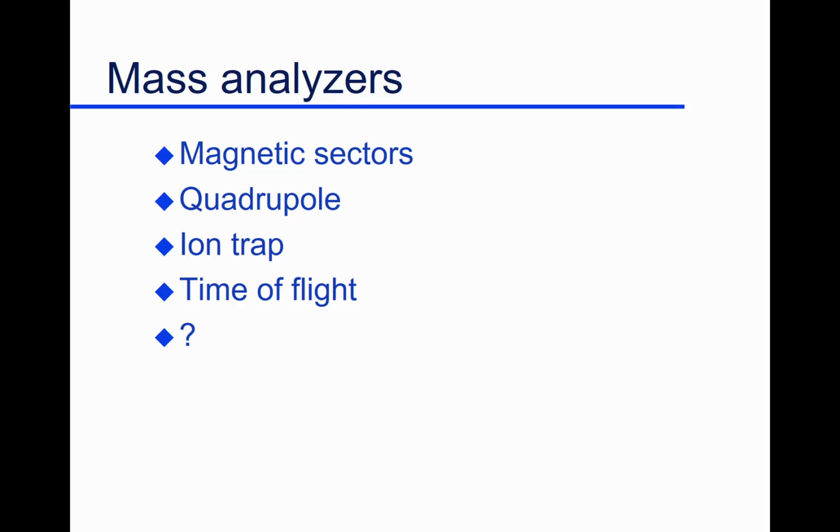But now we've formed a bunch of ions probably. There's seldom one thing there. There's perhaps many things in your sample. So you're going to have many ions. Now we need to start separating those ions. So we get an ion profile. What is the mass of that ion? Well, was it 2,400 and something in the last one? How do we know? So let's start separating those ions.